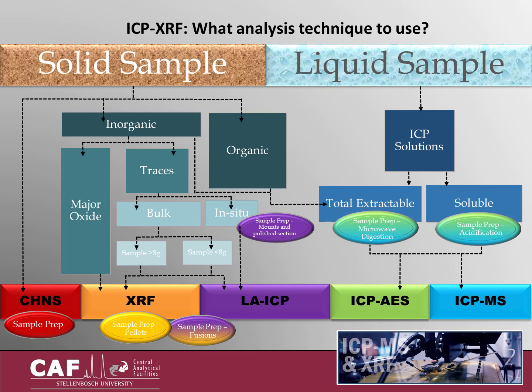For other major, minor and trace elements, there's different options whether you have inorganic or organic samples. So for major oxide analysis on inorganic samples, your typical analytical technique will be XRF. If you want to measure traces on inorganic samples, it will also depend on whether you need to do bulk or in situ traces.